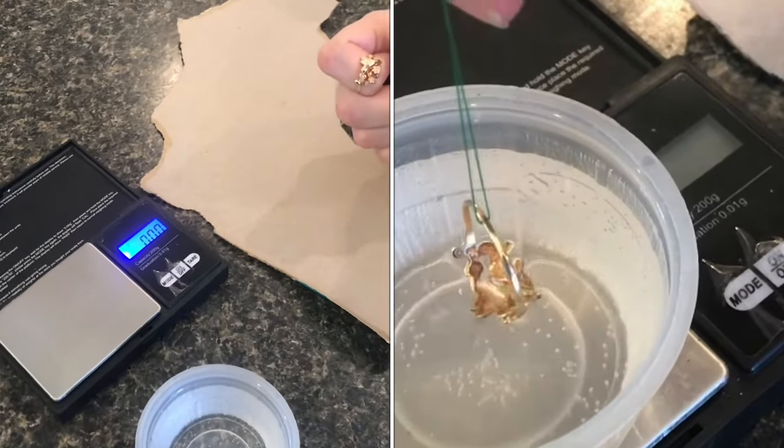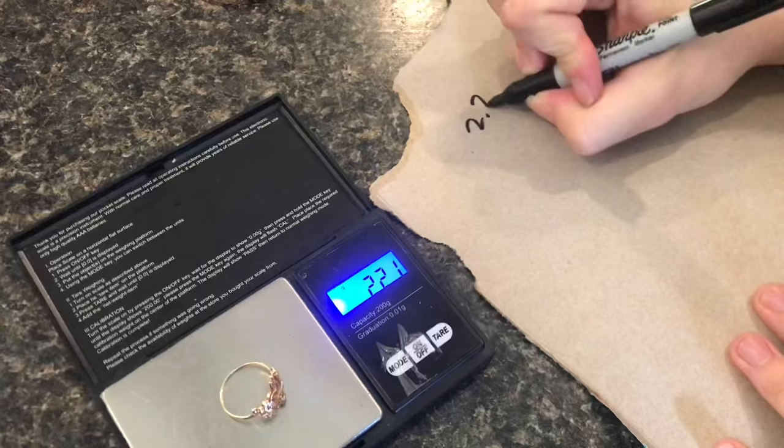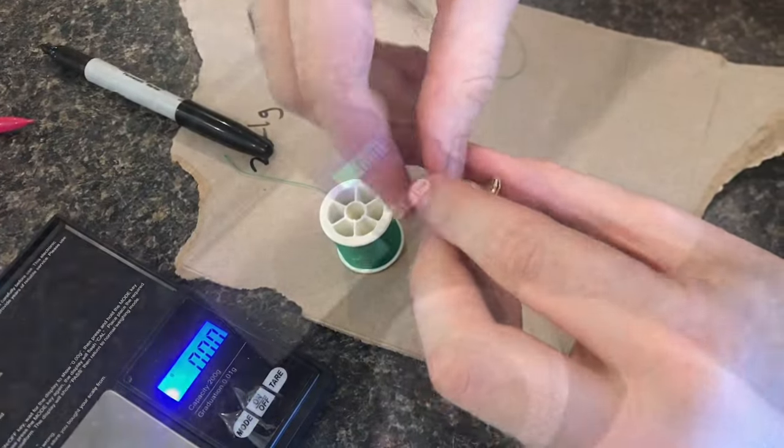We're gonna see if this is real gold using water. First we'll get the weight dry: 2.21 grams, and loop a thread through.